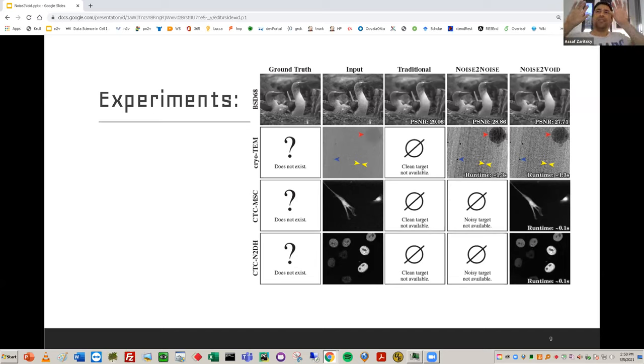What she showed is that she takes an image and reduces its resolution, right? Then she learns a mapping from the low resolution to the high resolution image. Then she uses the same transformation and tries to use the high resolution image to improve even further. So there is an assumption here, that the same transformation going from low resolution to high resolution would also work from high resolution to further high resolution.